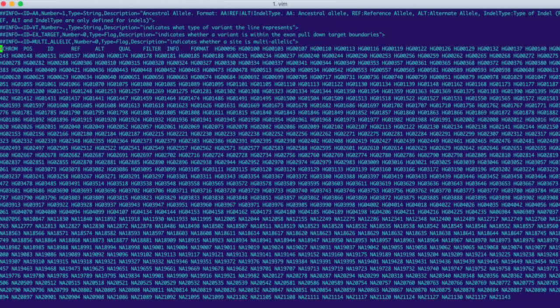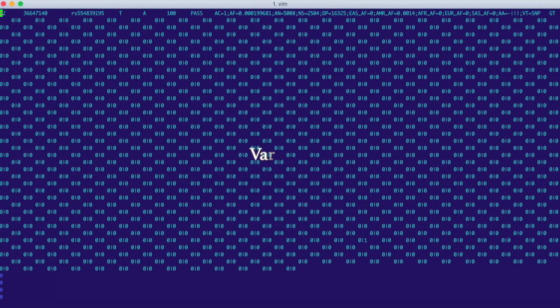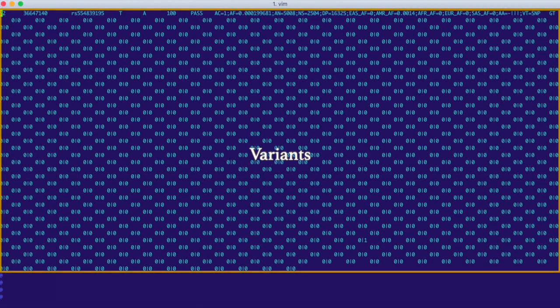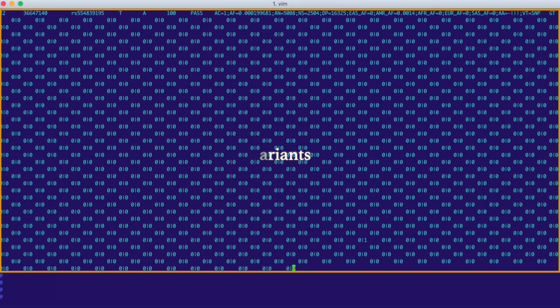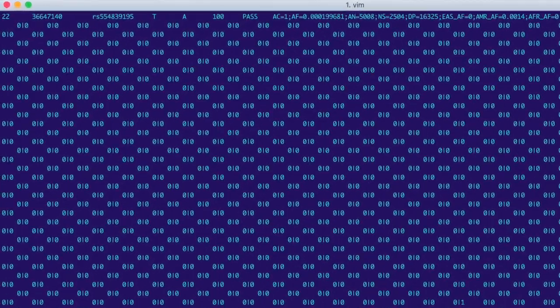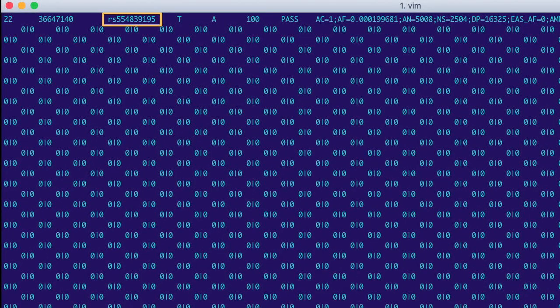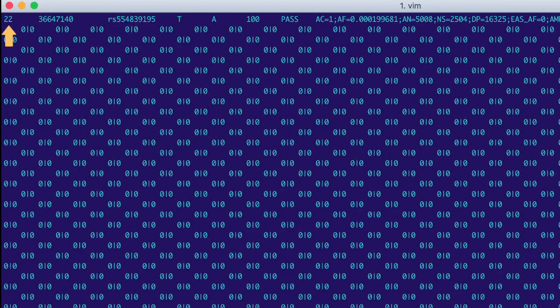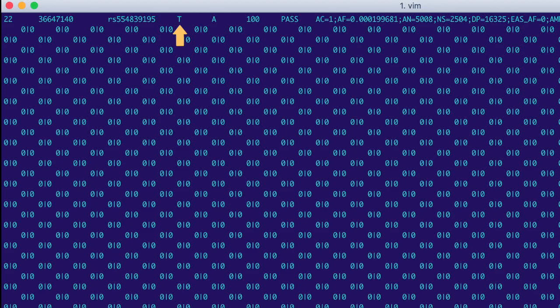To see this in action, let's take a look at the first row of variant data. So in VCFs, every variant gets one row. So this is the information for a single variant. This is telling us that this variant, called RS554839195, is on chromosome 22 at this position. Its reference allele is T, its alternate allele is A, its quality is 100, and it passed the filter applied.